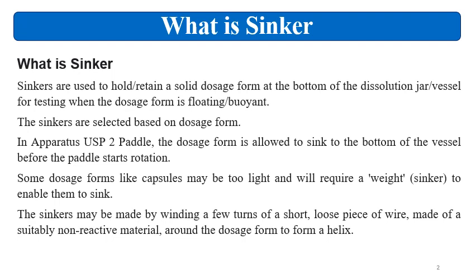So what is sinker? Sinkers are the material or accessories for dissolution testing which are required or which are used to sink the formulation at the bottom of the dissolution vessel. So sinkers are used to hold or retain a solid dosage form at the bottom of the dissolution jar or dissolution vessel for testing when the dosage form or formulation is floating or it moves into the dissolution bowl. The sinkers are selected based on the formulation or dosage form.